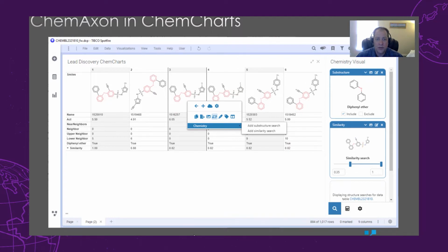The structure search controls on the previous slide were minimized using toggles at the tops of the controls to produce a simplified view. The visual is reactive to the amount of real estate configured for the visual. Structure searches will automatically be arranged either vertically or horizontally depending on the bounds of the visual. So that's a quick overview of the structure search features of the chemistry visual. I'd also like to point out the calculators and settings represented by icons at the bottom of the visual. Let's take a closer look at the calculators.